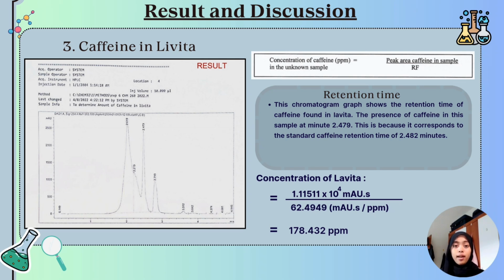So, next we move to the last result and discussion for our study, which is the caffeine content in Lavita. Based on the chromatogram graph, it shows the retention time for caffeine present in Lavita. The caffeine is present in the sample at 2.479 minutes. It corresponds to the standard caffeine retention time, which is 2.482 minutes.